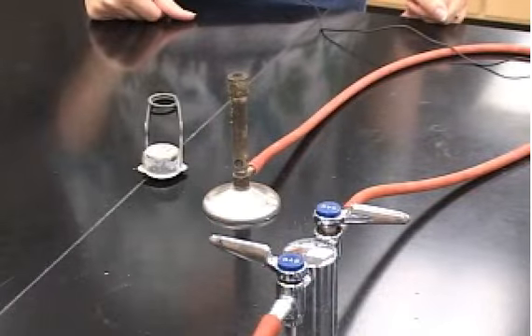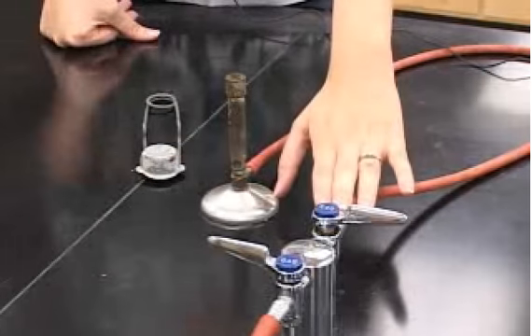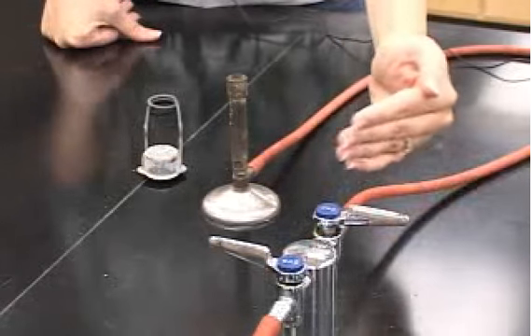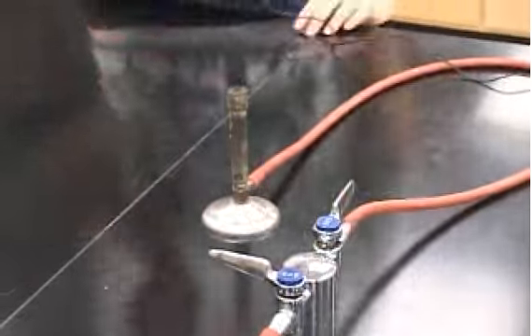Second thing on the list is Bunsen burners. There will be some experiments where we will need heat, obviously, for reactions to go, and we'll need to light the Bunsen burner. So first, I'll give you a tutorial. Each lab station has a Bunsen burner present, and what we'll need to do is have the nozzle and the valve on the table line up parallel, and then you'll use a striker to light the Bunsen burner.